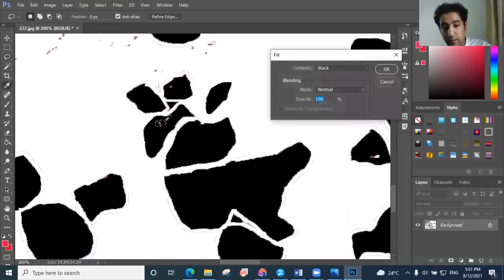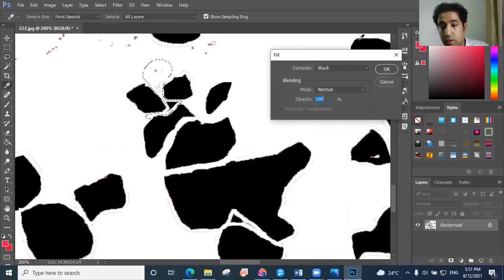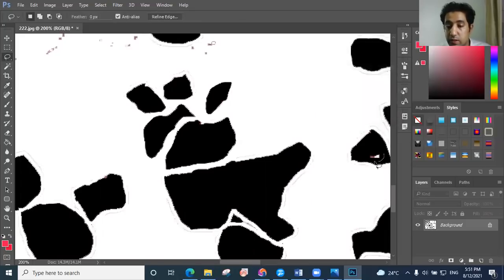Actually, in the grains, if you have some dots, they will not be counted as a grain, but just to make exact work, or good work, and not to have to repeat it in the future, just do this.